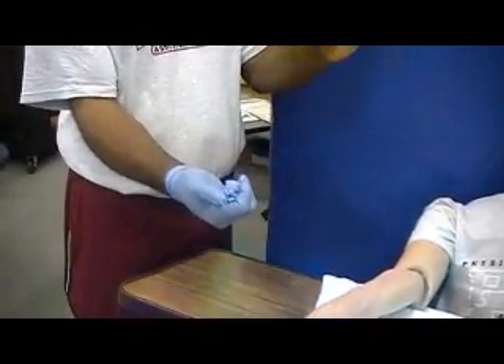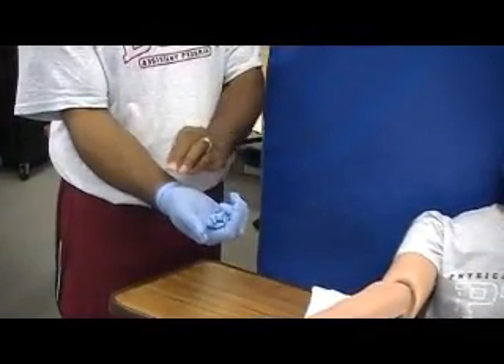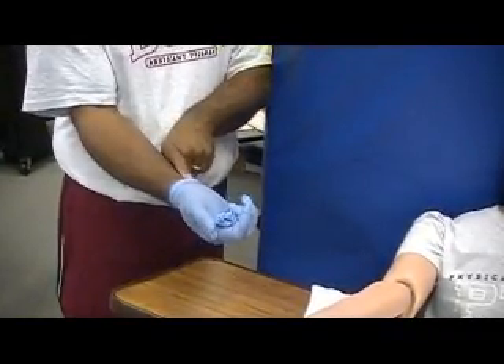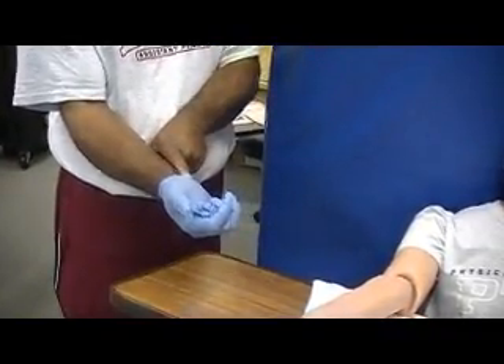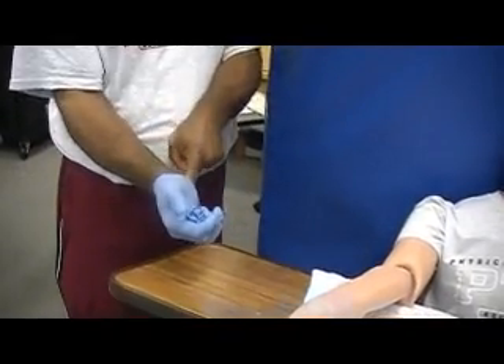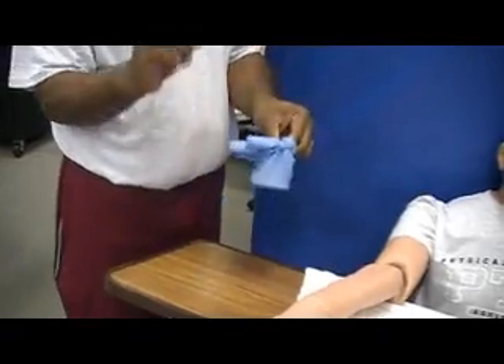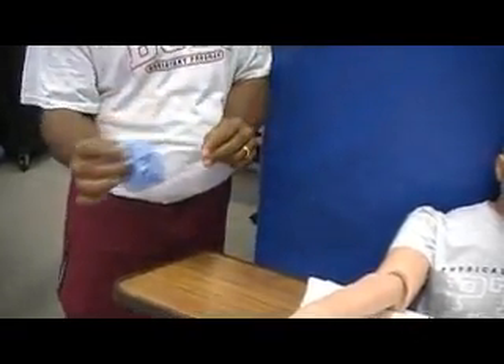We don't want to take the bare hand and touch the glove, because that could further infect. So take your index finger, go along the volar surface, and pull the glove inside out. That's the way to avoid infecting yourself. Of course, take the gloves and put them in the trash.